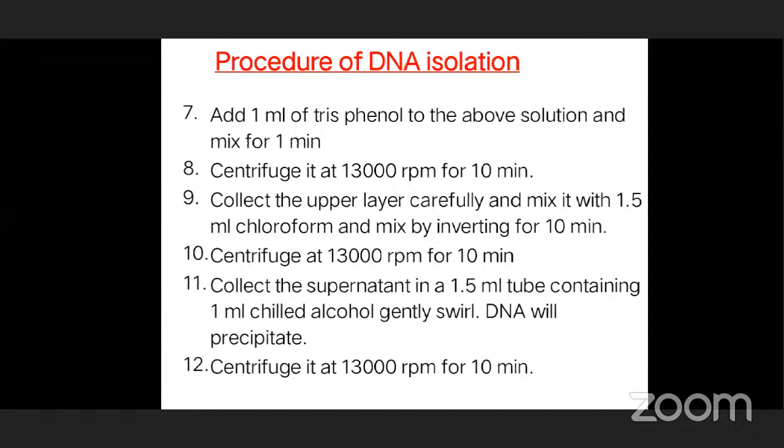After the centrifugation, WBCs and the cell debris settle down and the clear solution contains DNA. The settled component contains WBCs. Cell debris means carbohydrates, lipids, and protein. These settle at the bottom and the clear solution contains DNA. This is transferred to another tube. Also, inversion for 10 minutes.